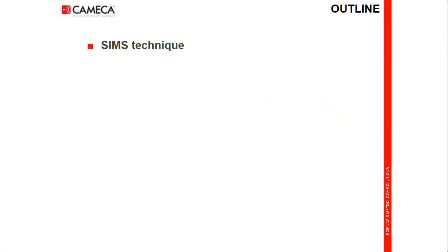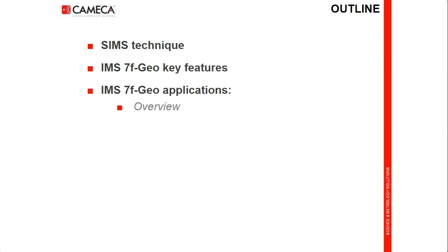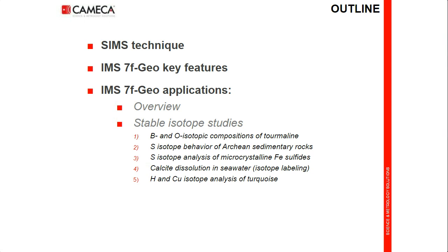This is the outline of my talk. I'll start with a small introduction to the SIMS technique. Then I will show the key features of the IMS 7f-GEO and applications of this instrument, starting by a small overview. And then I will show 5 different studies based on stable isotope measurements performed with the 7f-GEO. To finish, I will show an overview of the SIMS models proposed by CAMECA for Geosciences.